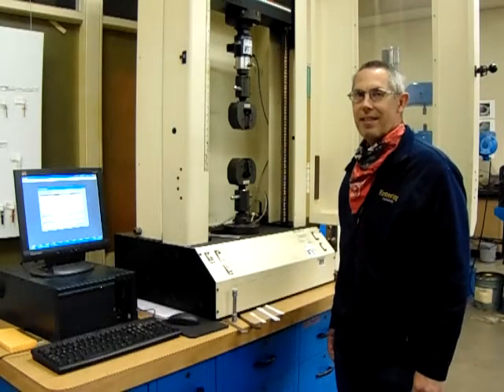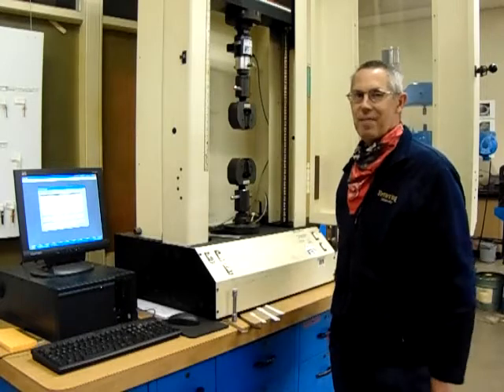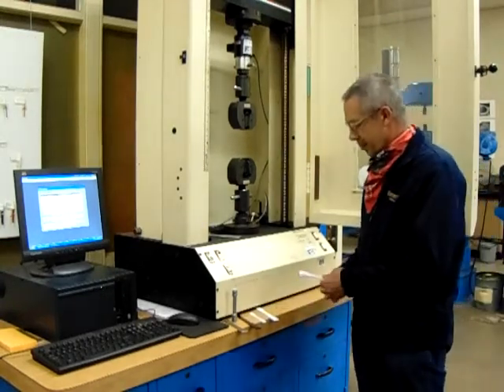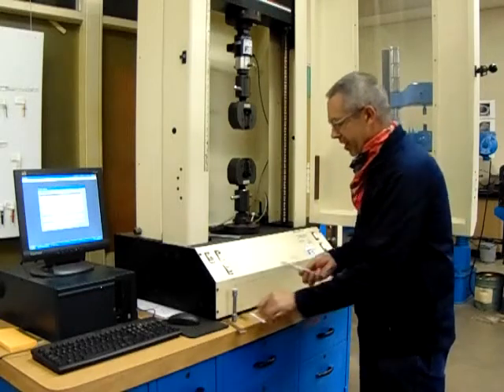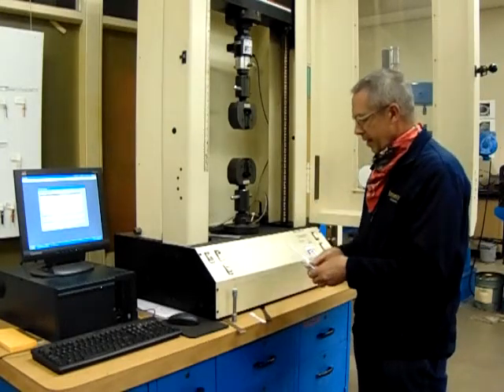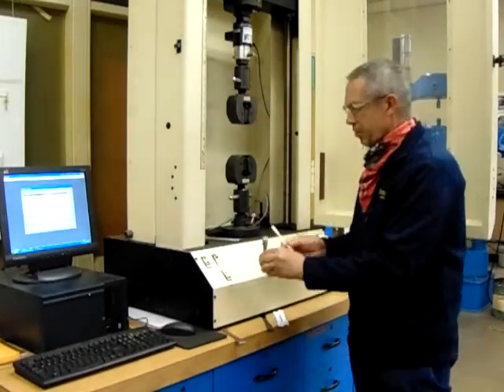Tensile testing. So today we're going to be here at the UTL's tensile testing machine. We've got some 3D printed dog bones, which actually match our injection molded dog bone. And we have some other types of tensile test samples that you can use.